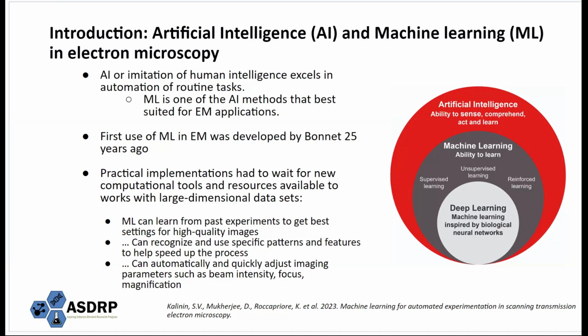a lot of the electron microscopy, especially with the scanning electron microscope at our lab, is tedious and manual labor that can be well automated. And machine learning in the field of electron microscopy is nothing new, as one of its first uses was almost 25 years ago by Bonnet and his group. So the practical implementations had to wait for more computational tools and resources available that we could work with large scale and large dimensional data sets.